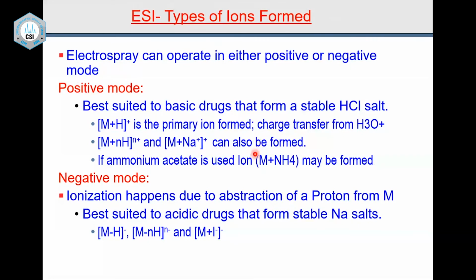So that is the type of ions. I should put a plus here, and a plus here like this. I will correct it today after the lecture. And this H3 should be down here. So the water gets protonated, and the protonated water can give an H plus to this. So this is how the mechanism takes place. So please remember, it is a solution chemistry.